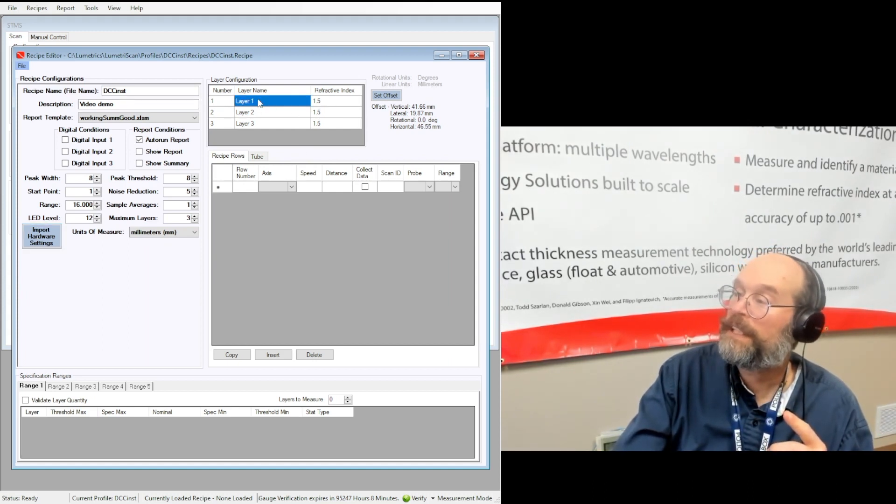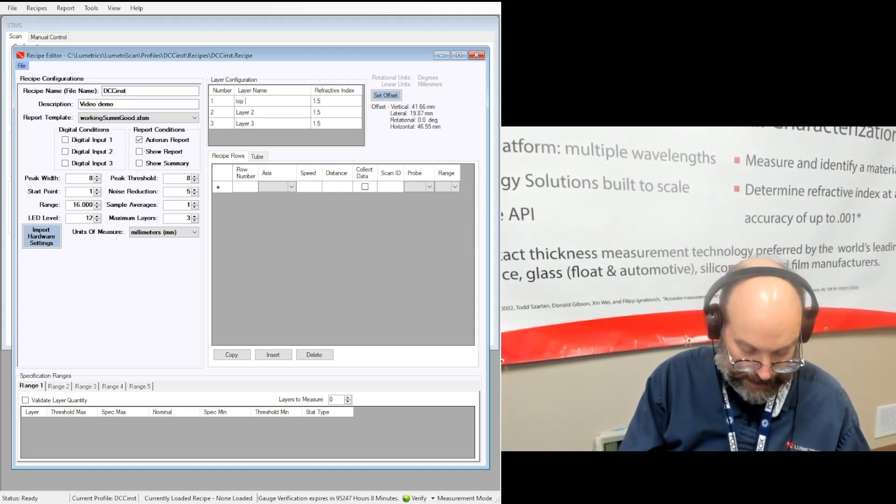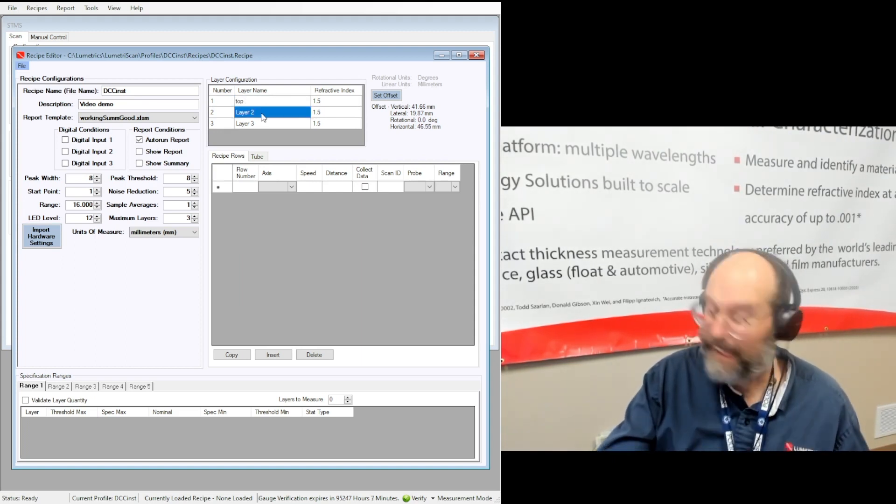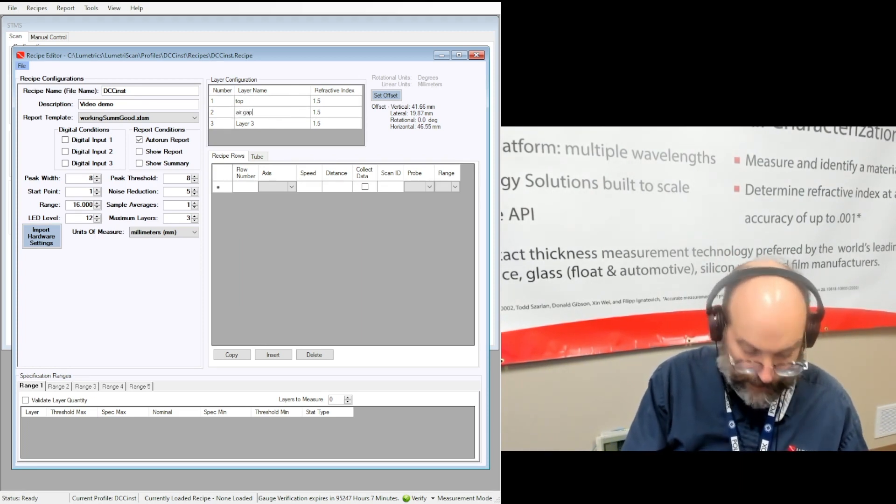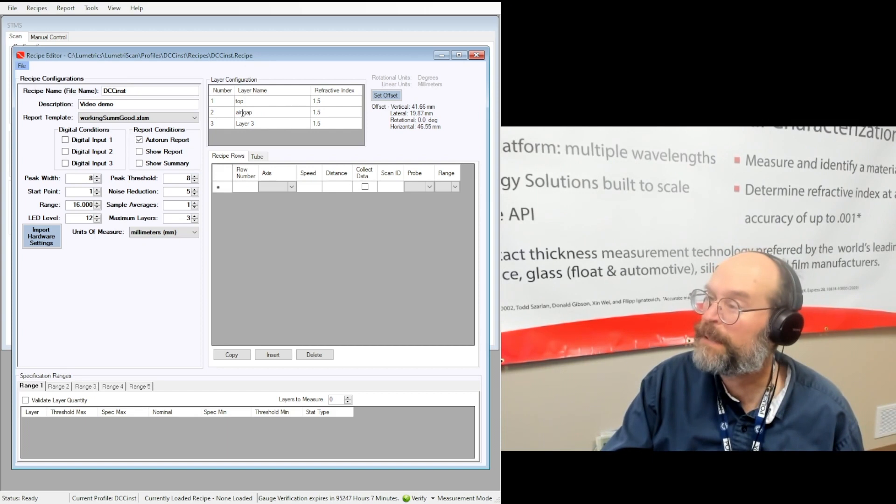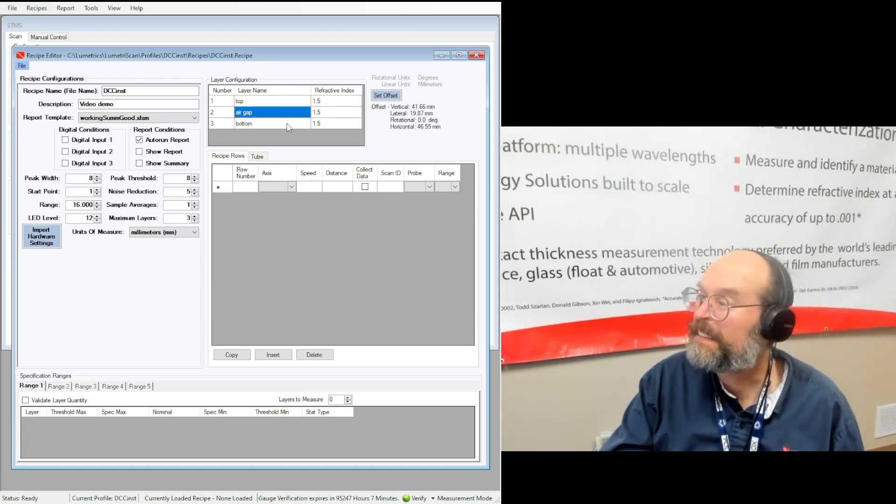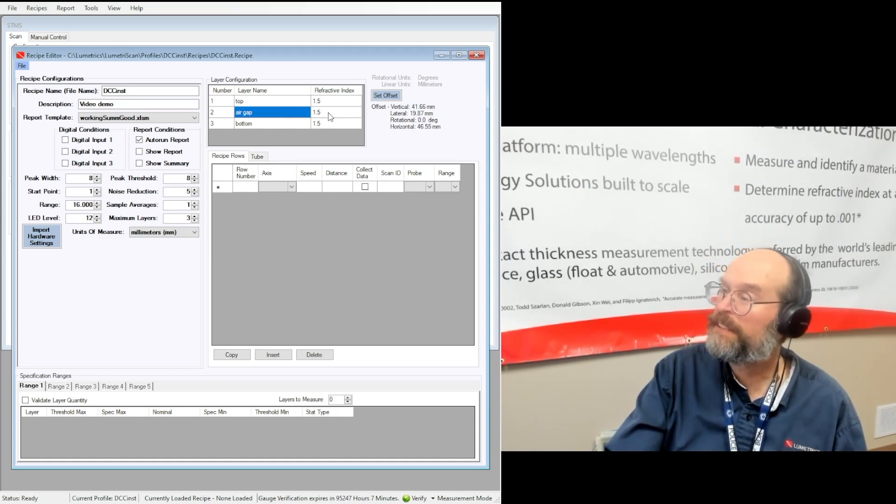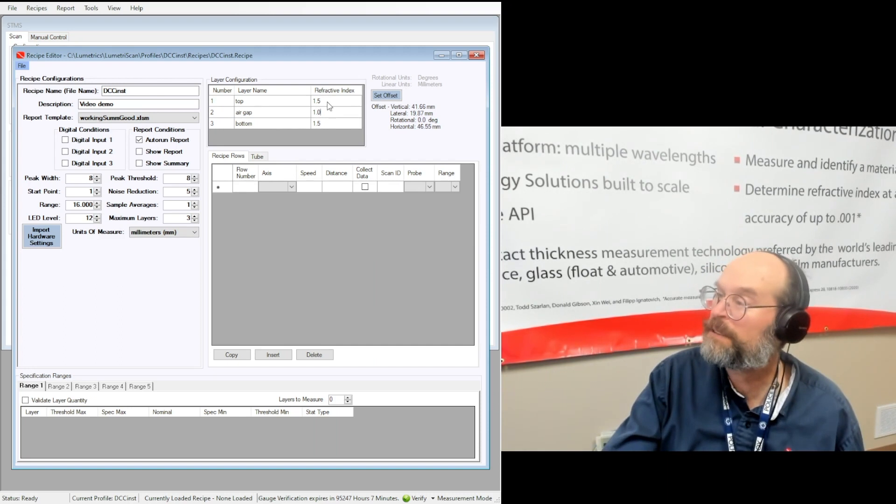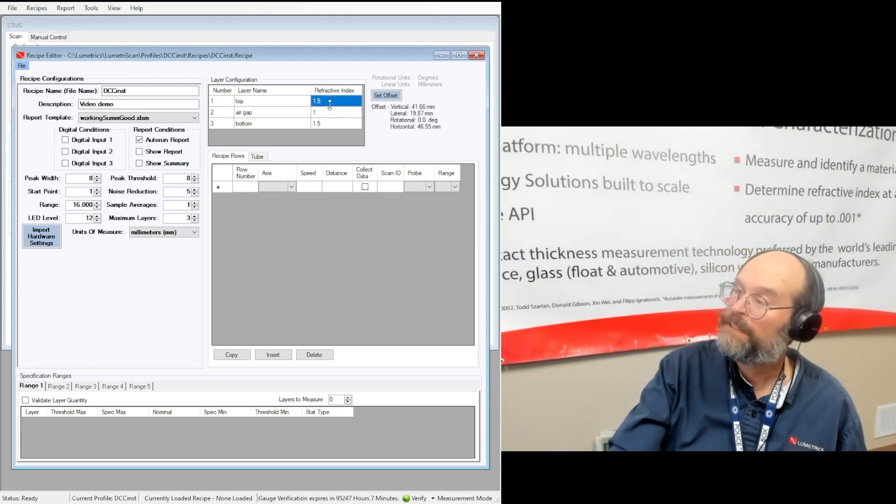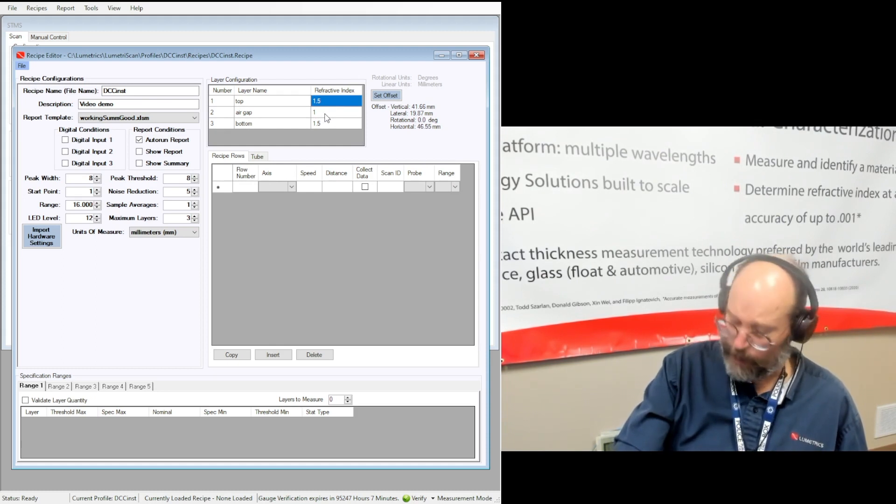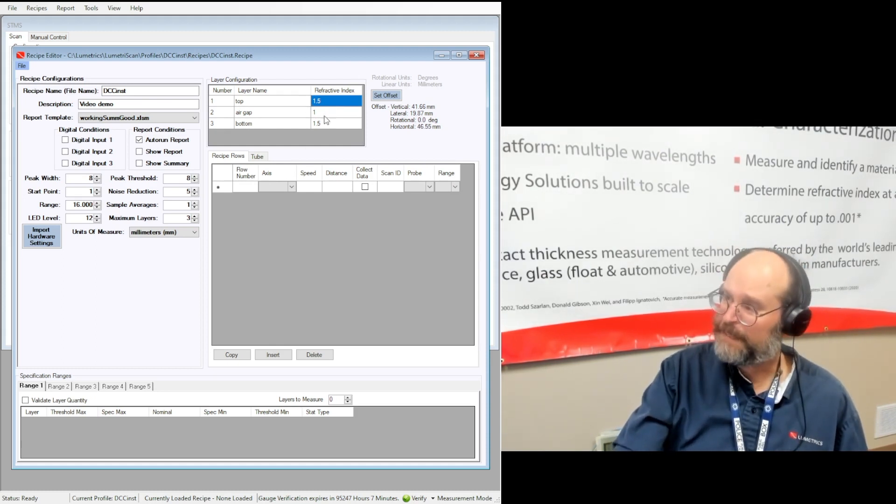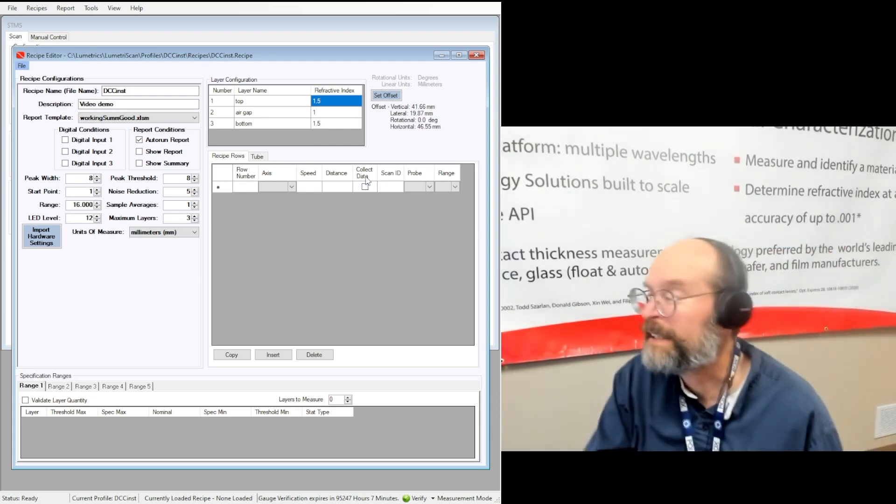You can name each layer, top layer, air gap if you have a tube. So it's the top of the tube, air gap, and bottom of the tube. There you go. The other thing you can do is give everything an index of refraction. If you know the actual glass index, you put it in here. 1.5 is a pretty good starting test. 1 is great for air. And 1.5 again for the bottom glass.